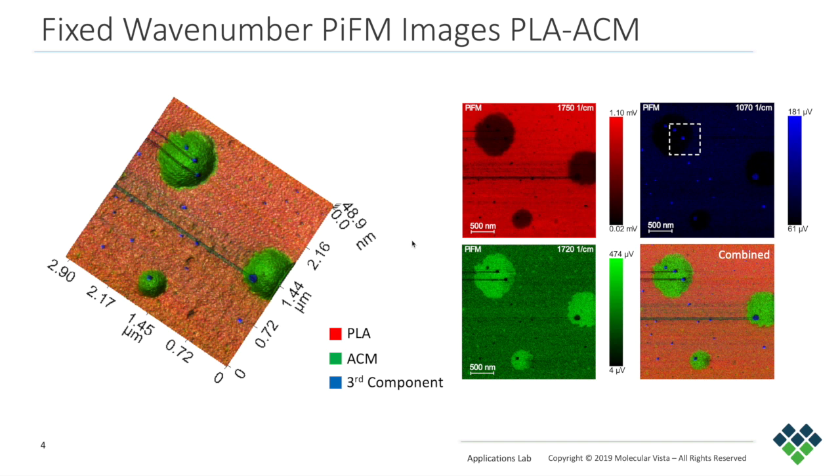Now the pasting of those images, they do come in vector-based, so it's very easy to rescale them. And also you can ungroup them and then modify the text if necessary for publication. But these images are publication ready and publication quality.